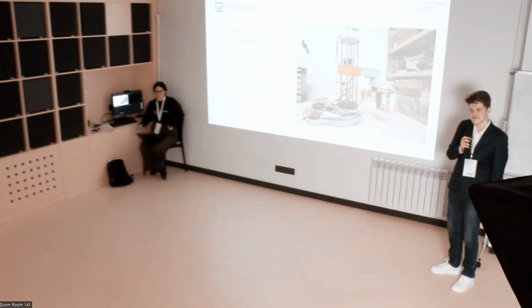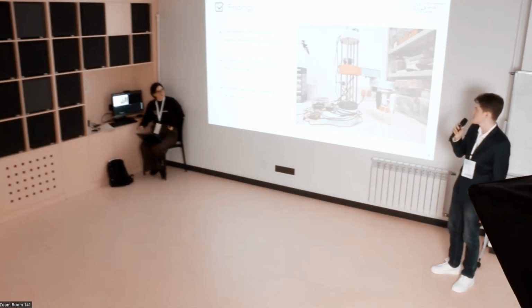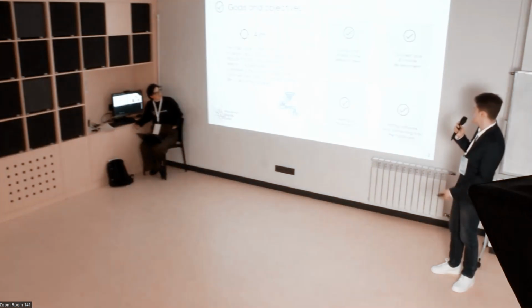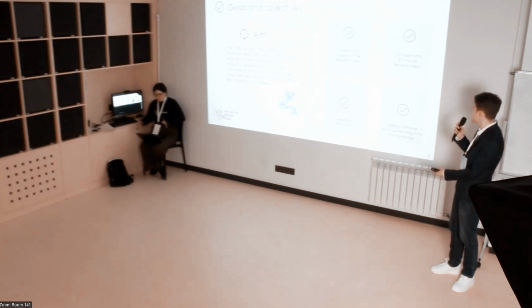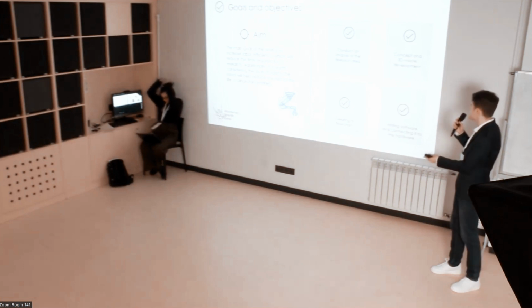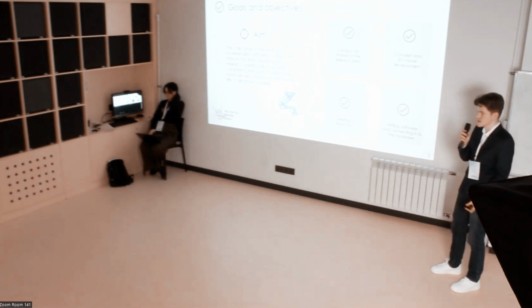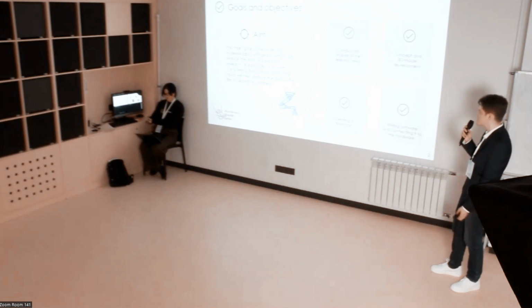Thank you. So you presented quite a complicated project: manufacturing, programming. What exactly did you do? Yes, thank you for the question. First of all, I did the analysis of the research area. I took part in the concept and 3D model development. I created a flowchart, and I got some help with software because I'm not so good at programming, but I really improved by doing this project.